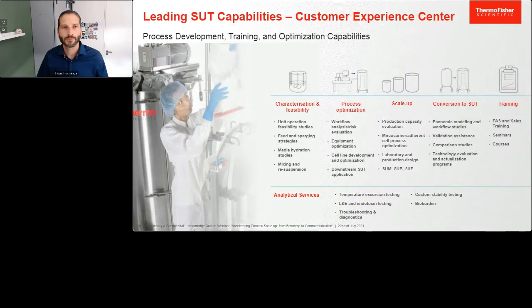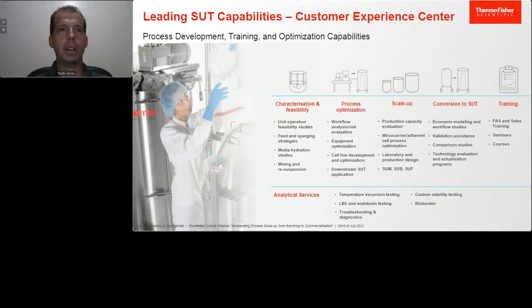Yeah, sure. Thanks, Floris, for the great intro. Yeah, we have a strong focus on R&D efforts on bioprocessing, right? That's the core of what we do. And our capabilities include process and equipment characterization, process development, engineering scale-up, single-use feasibility, our analytical services, particularly with an emphasis on leachable extractables according to BPOG, and training.